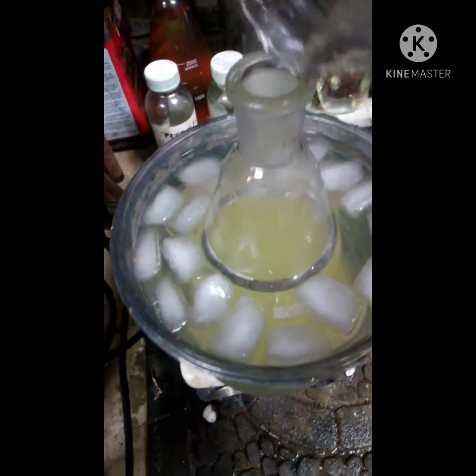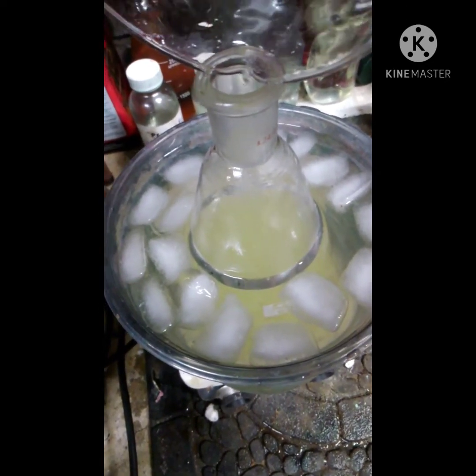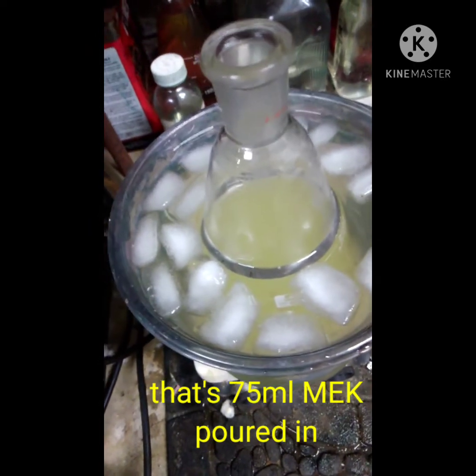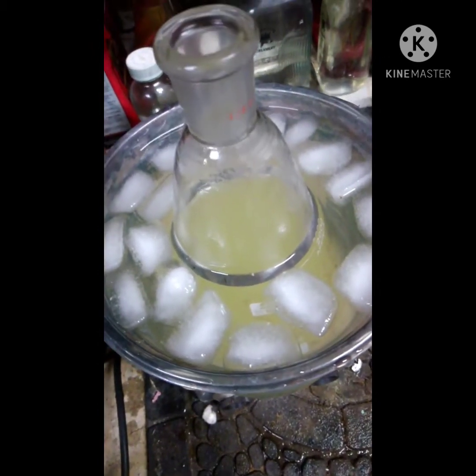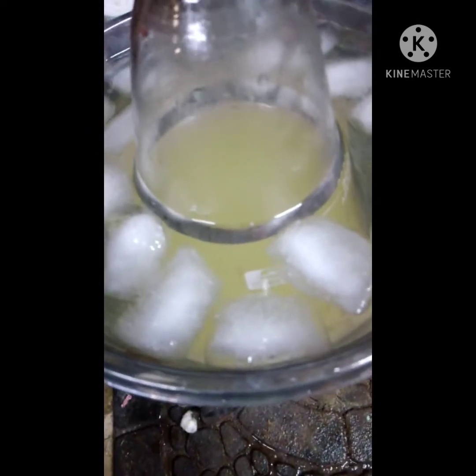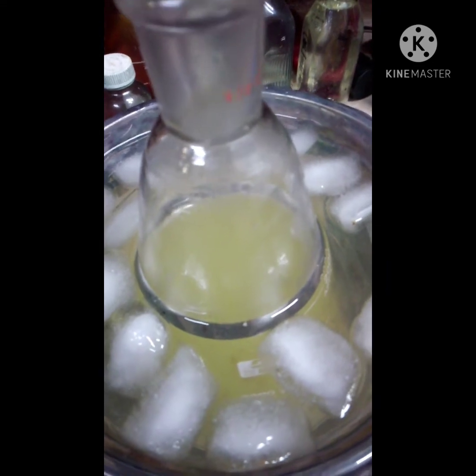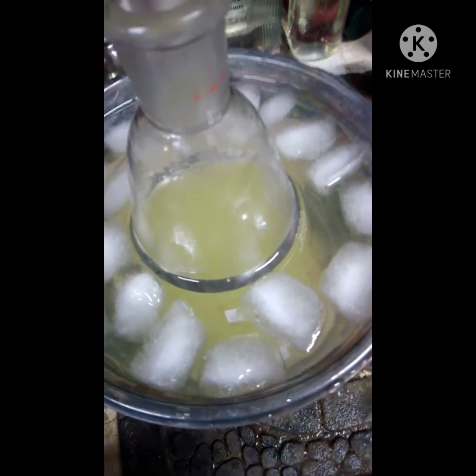Alright, I'm going to add the rest of this. Now the other way you can do this is just by adding your MEK directly into your bottle, but I'm not doing that so I could show you guys the color change.